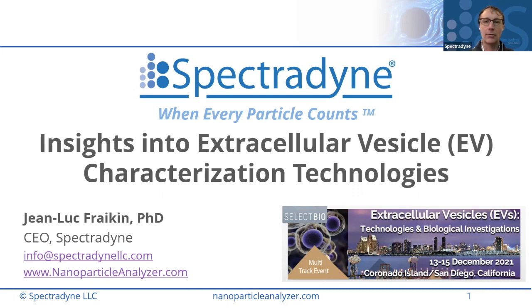Methods for characterizing extracellular vesicles are evolving, and new technologies are being developed all the time that deliver size, concentration, and now fluorescent phenotyping with different degrees of success and different advantages and disadvantages. In this presentation, I'll review how some of these new and cutting-edge technologies work, compare their strengths and weaknesses, and share how we at Spectradyne see the technology landscape evolving next.